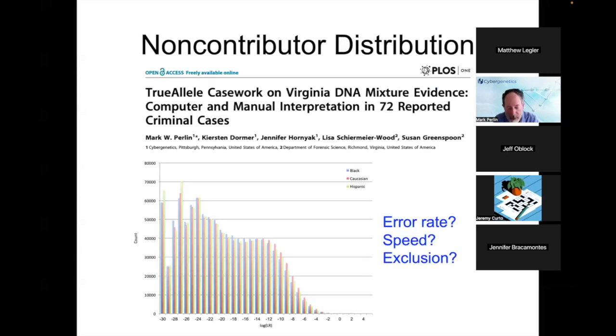And there at the bottom right of the curve, you see 0, 1, 2, 3. You see almost nothing there. That's the area under the curve that's related to the probability. But what's in that bin and further to the right as well will give you the error rate.